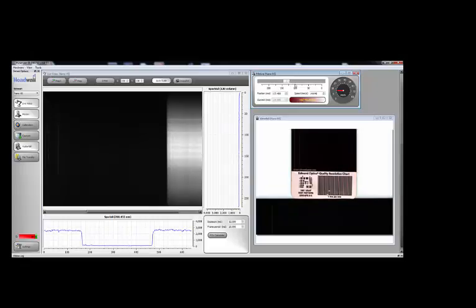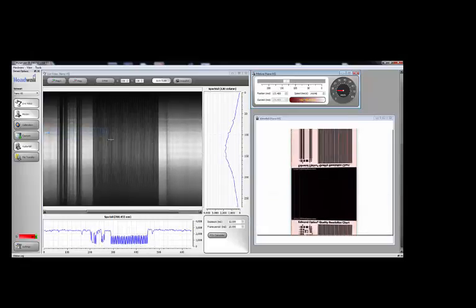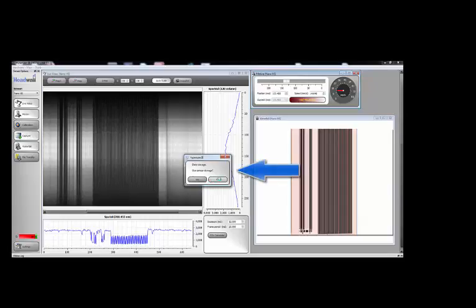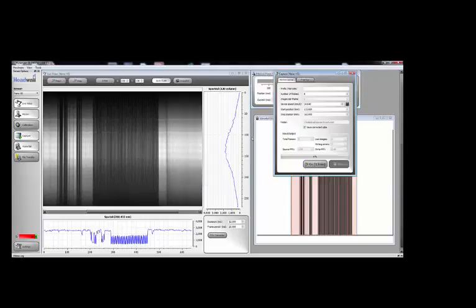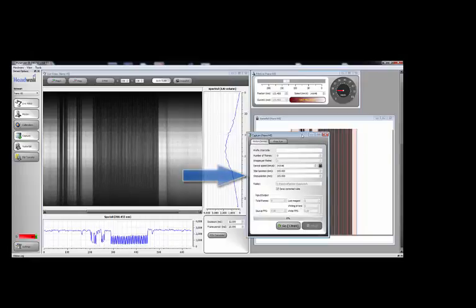At that point, click the Capture button to enable that feature. We're using a Nano for this example. That opens the option to save on either the sensor or the computer. Click No to save on the computer. The Capture feature opens.